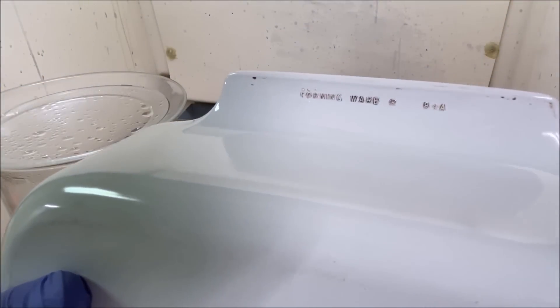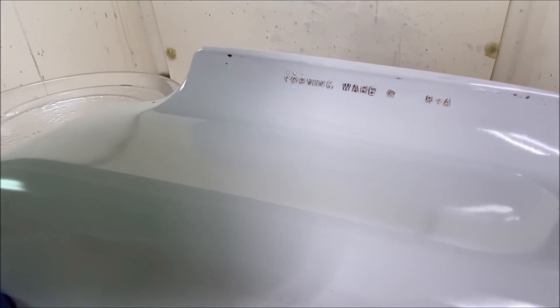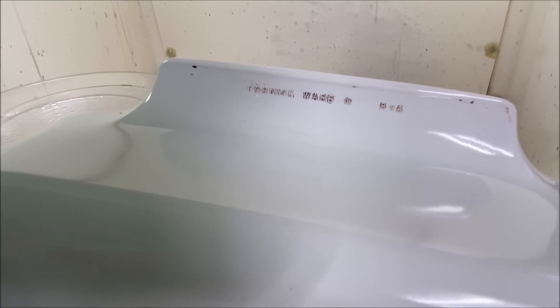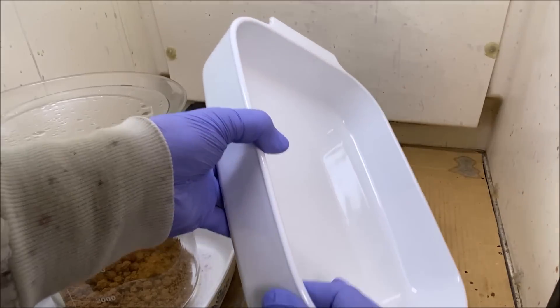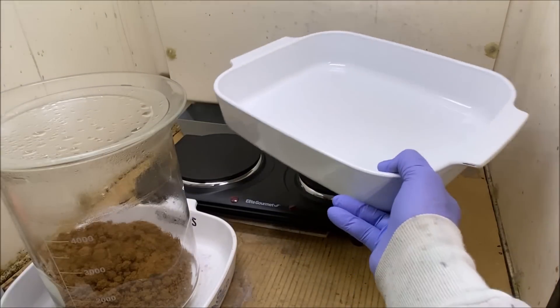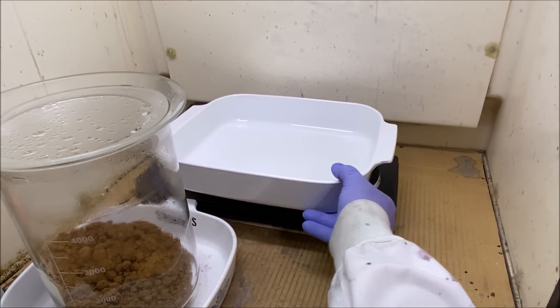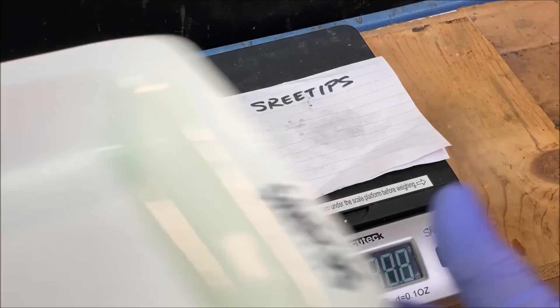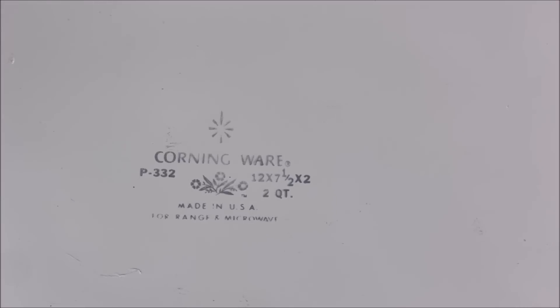Folks had asked about these pans. You can see right there it says Corning Ware — these are Pyroceram, very tough, they'll take a lot of heat, but they will shatter if you get them hot and put liquid on them. I have another dish here that also says Corning Ware — that's how you can tell if you've got the real thing.